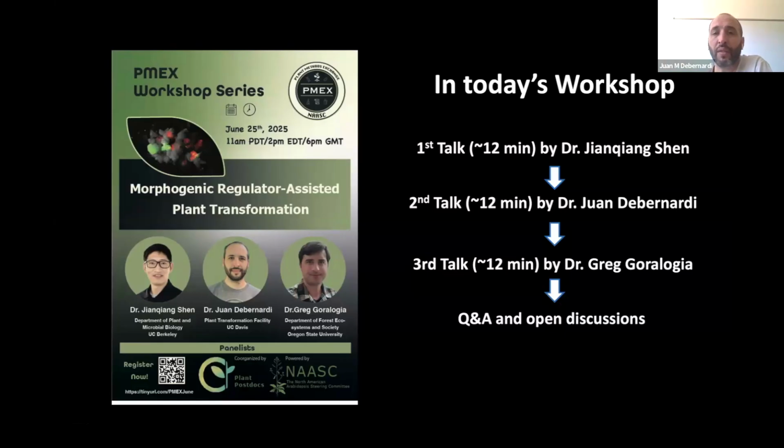In my experience, GRF-GIF works well, but we used it in a protocol that was very good already. It had a low regeneration efficiency, but all the cell biology and tissue culture was fantastic, and GRF-GIF works well on that. There is an example, Andrea Gallavotti in maize, who combined Baby Boom with GRF-GIF and also observed synergy. I know that people from the University of Florida are using Plethora 5, a Baby Boom-like gene, together with GRF-GIF with good results.